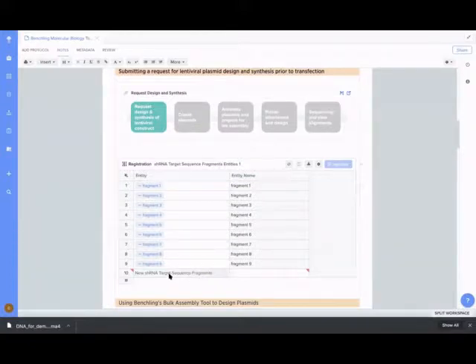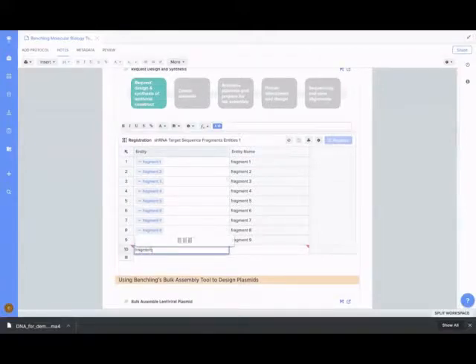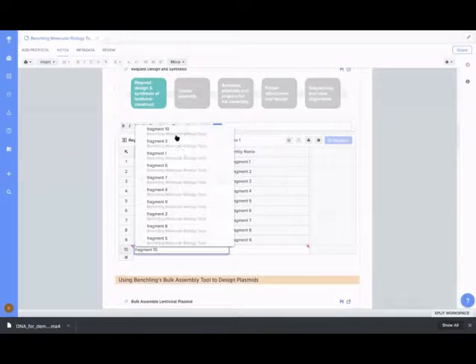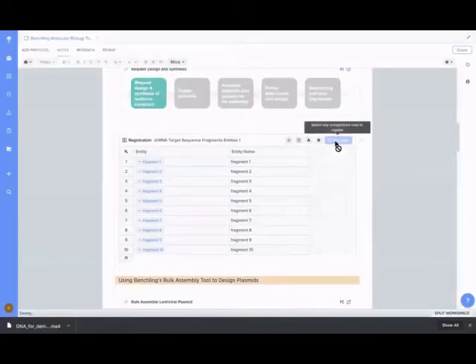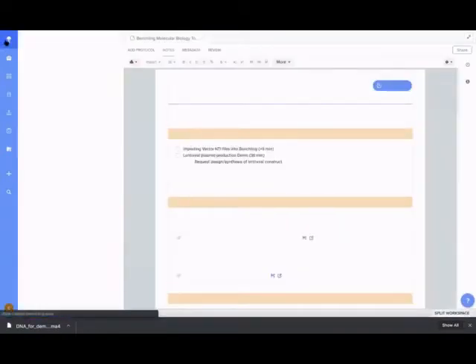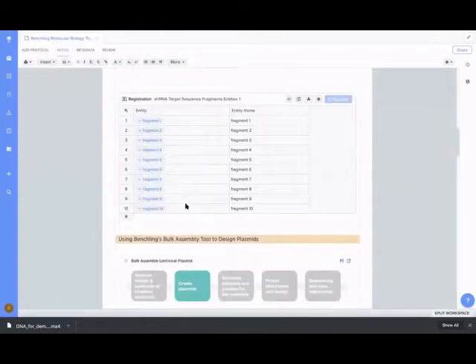You could imagine that the scientist could come into Benchling and utilize something like Benchling's registration tables, which is an extension of our registry application, to register the shRNA oligos that they've designed. With a couple of easy clicks, they're able to register these shRNA oligos so that they can reference them later down the line and prevent any redundancy from people recreating those fragments.